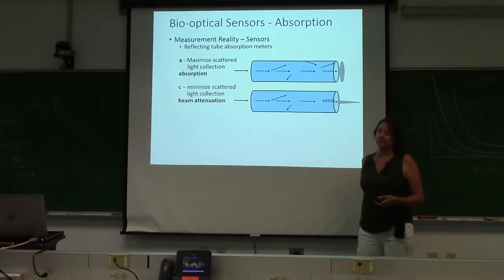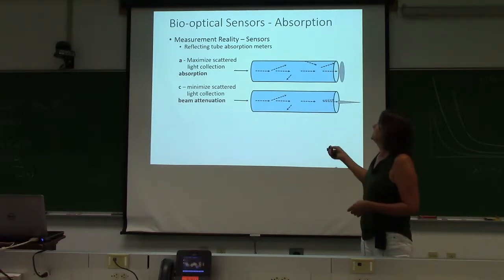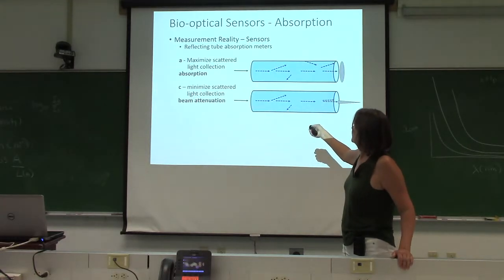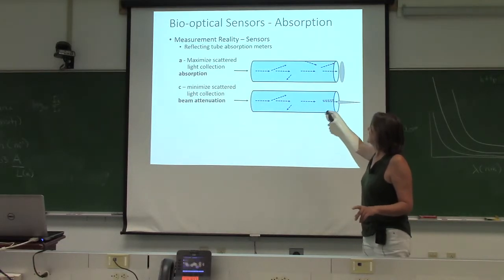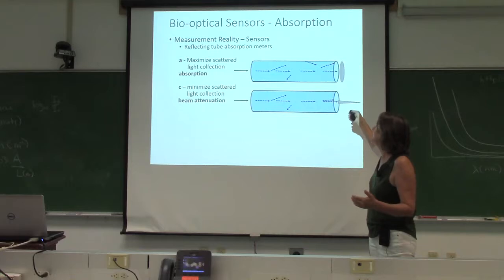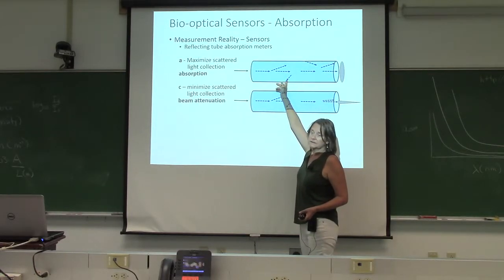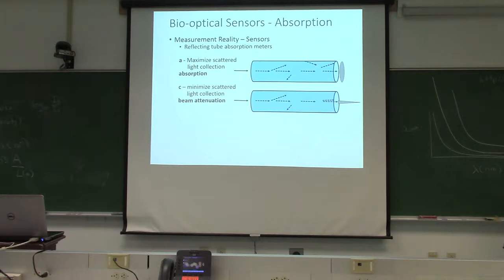But wouldn't this make your absorption larger, to collect the scattered light, because the path will be longer? Exactly. But it will be smaller than if you didn't collect the scattered light. If this scattered beam went out and didn't go to the detector, you would call it absorption. So you're collecting all of this scattered light, which is increasing the optical path length, but then at least you're collecting that photon on the other end. But that's exactly one of the corrections that you have to think about. And you're not going to collect that one at all. Right, that one's going to either go out or scatter back or something.